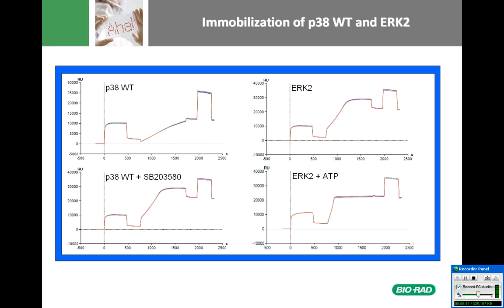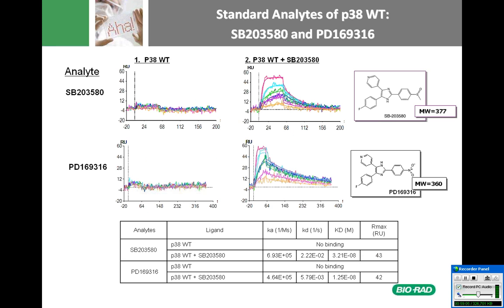So on channel 1, the P38 was just immobilized. On channel 2, the ERK2 was immobilized. And on channel 3, the P38 was immobilized with pre-incubation. And here as well, ERK2 was immobilized after it was pre-incubated with ATP.